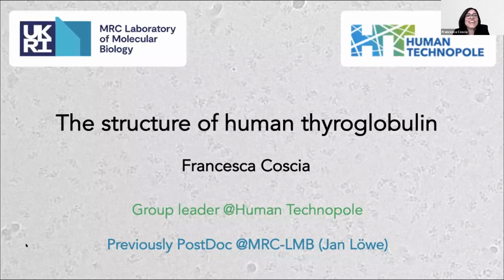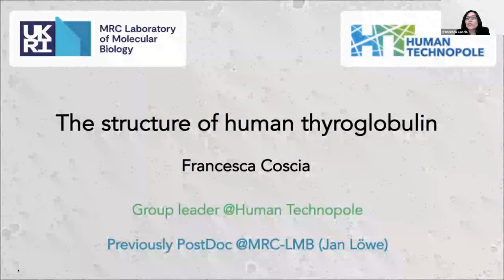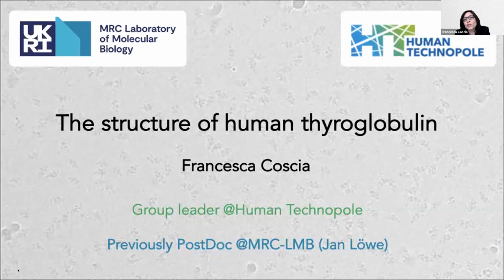Okay, thank you. Thank you, Neil, for the nice introduction, and thank you to the organizers for inviting me. So today I'm glad to tell you about the story of thyroglobulin structure determination, which was performed by single particle cryo-EM during my postdoctoral work at the MRC LMB in the group of Jan Löwe.